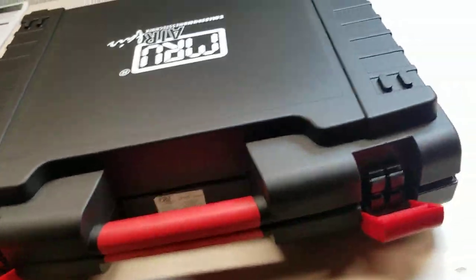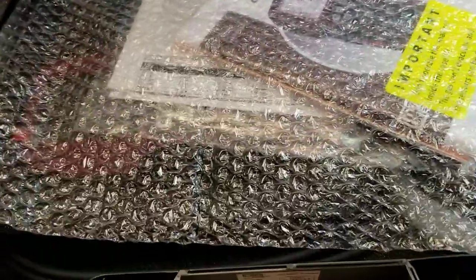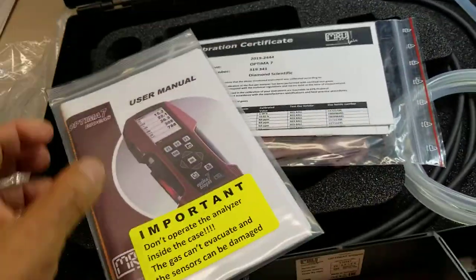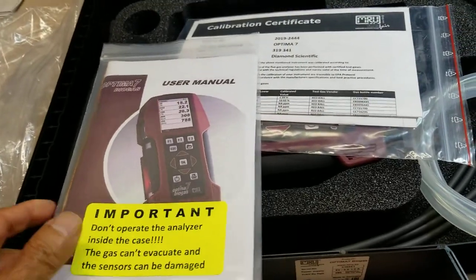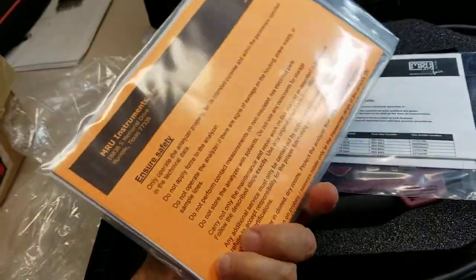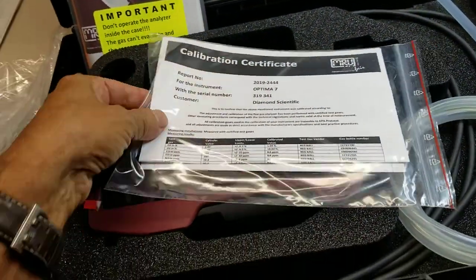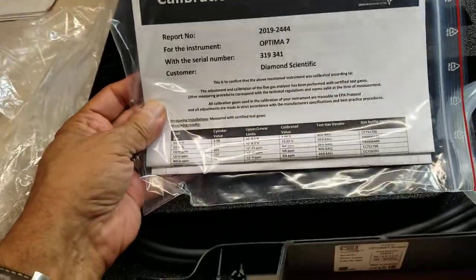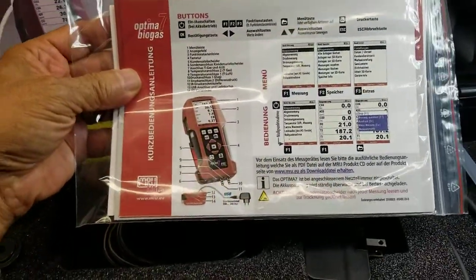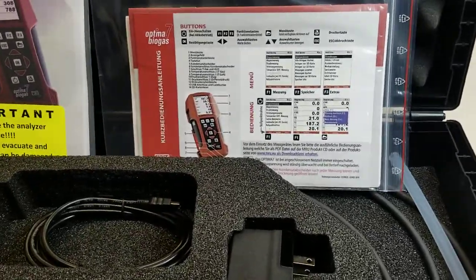As you can see, it comes in a nice sturdy carrying case. Everything here is from our German manufacturer, although we carry parts and service for all this instrumentation here in the U.S. It includes a paper manual — you don't see those too often today, most manufacturers want you to get those online — a certificate of calibration with the gases, and user-friendly instructions that allow you to look at the pictures and walk through it as you turn the instrument on.